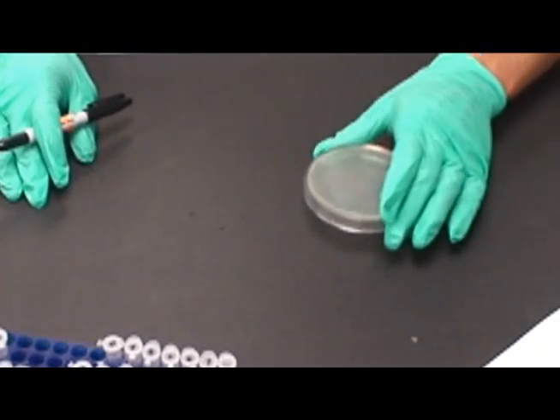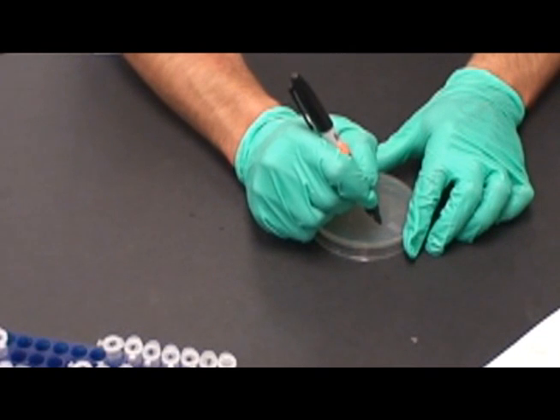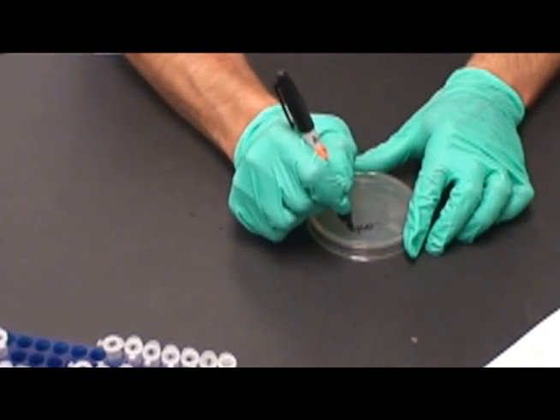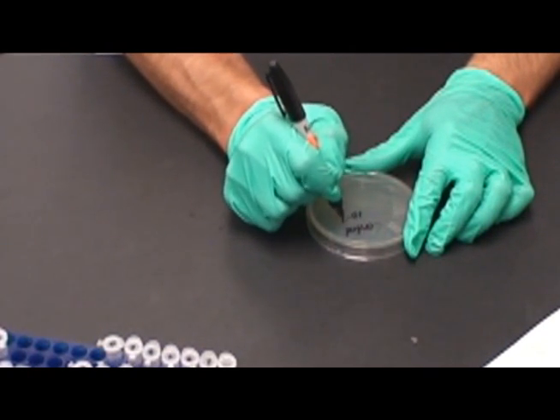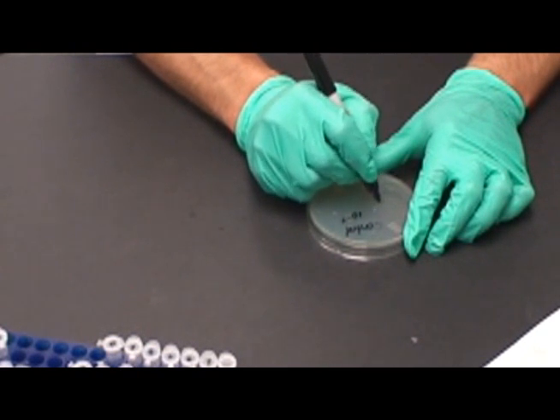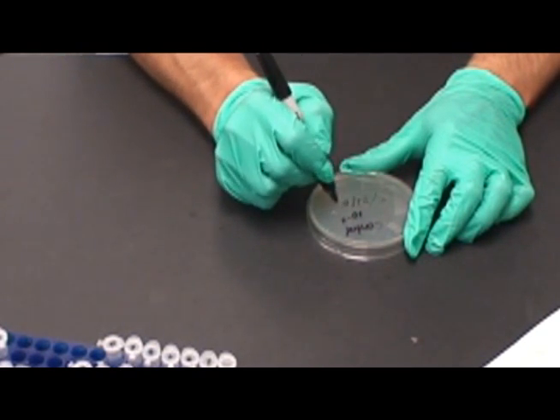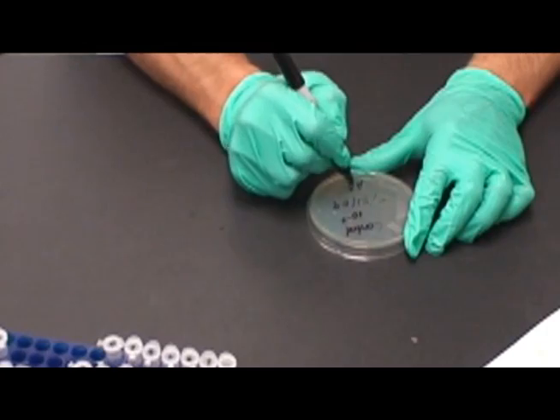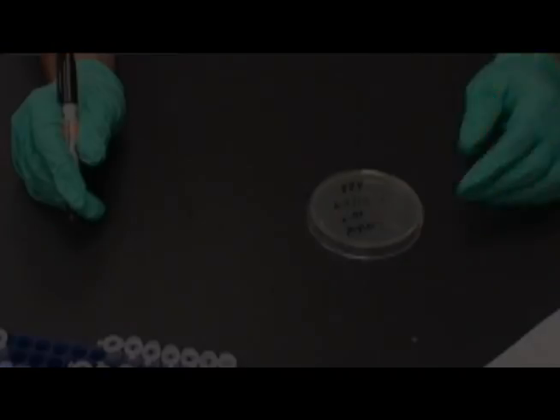Once the dilutions are complete, label the 15 LB agar plates, as shown in the lab procedure. Make sure to include your initials, the date, the flask name, and the dilution on the label. Do not label the cover of the plate, as these can be separated from the bacteria.